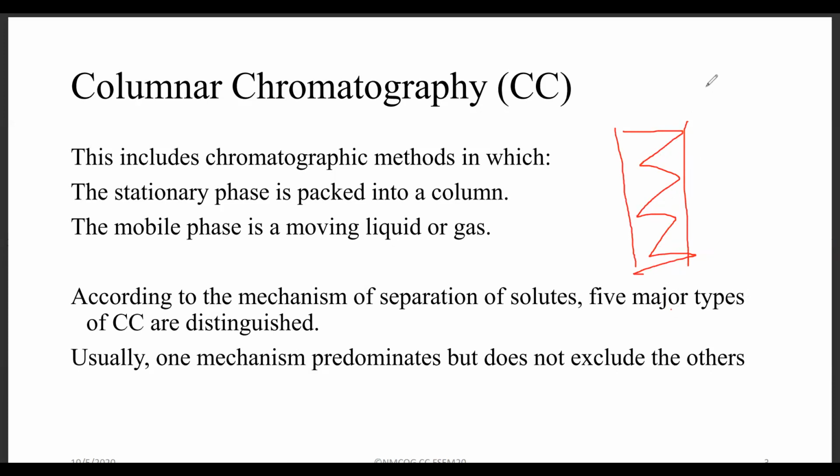And then you have a mobile phase which is traveling through the stationary phase. And the mobile phase contains our analytes or whatever we have. So it's within our mobile phase.